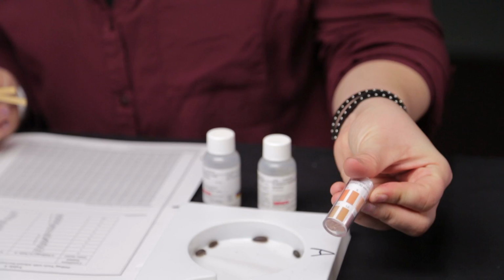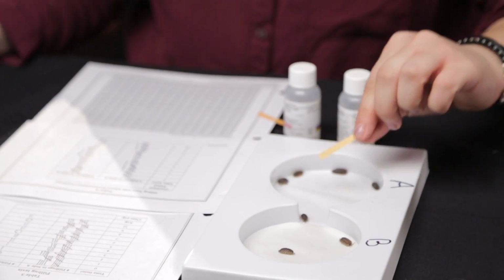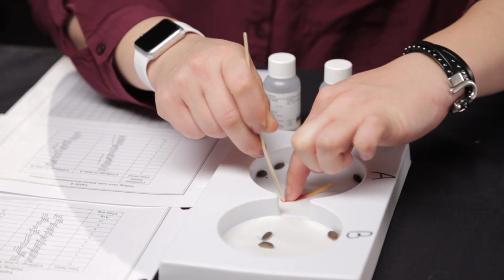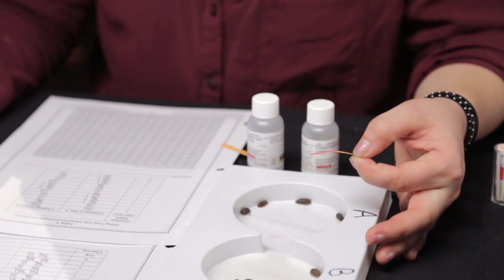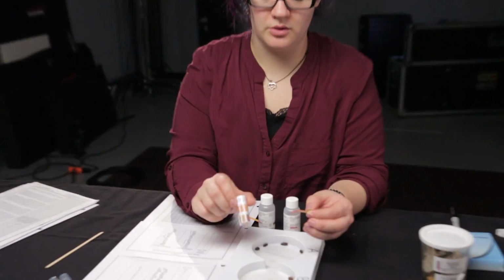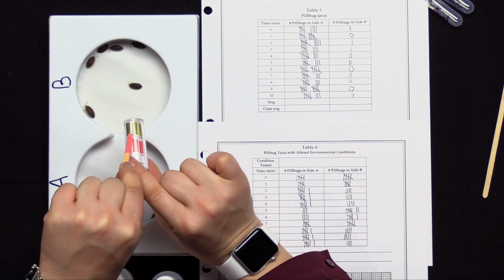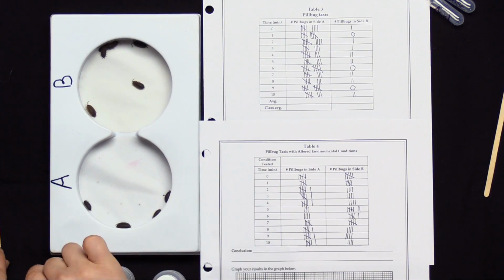So I have a pH testing paper here, and let's see if I can try this. See if I can press it against the filter paper to test the actual paper. Now it's weak enough acid that I'm not going to hurt my hand because, like I said, we actually drink acids: lemon juice, orange juice, soda. Those things are all acidic. So I compare this to my testing paper and I try to match and see what color it is. I'd say that's a pretty solid 2, which means that this is fairly acidic. So at least this is definitely acid on that side.